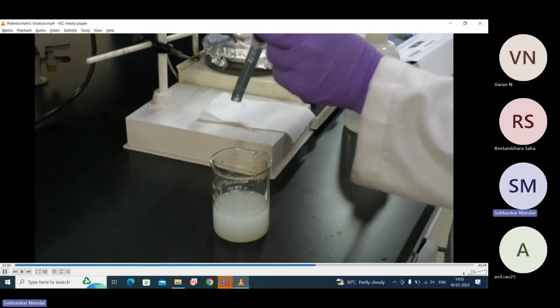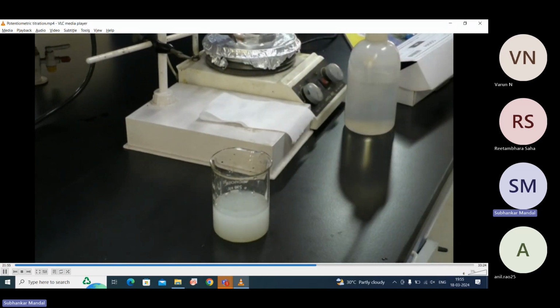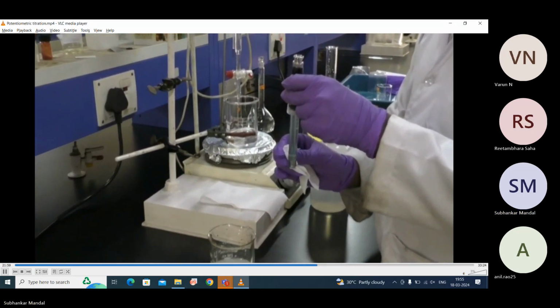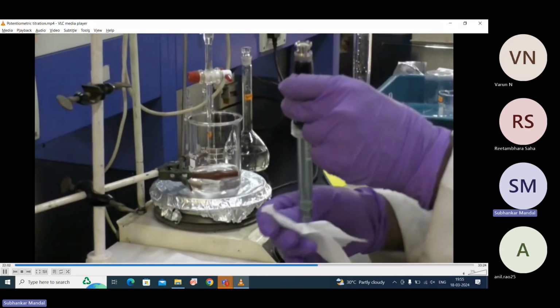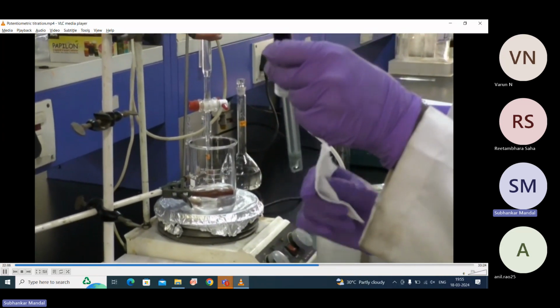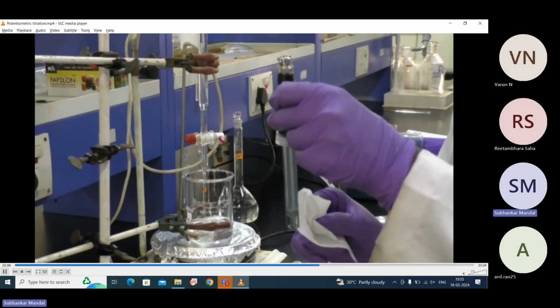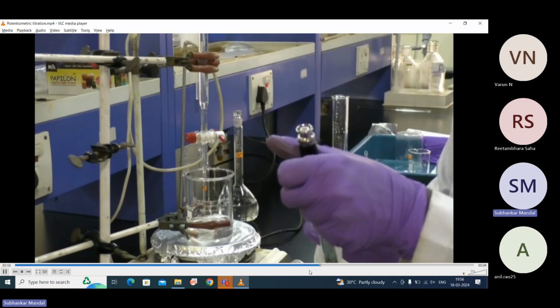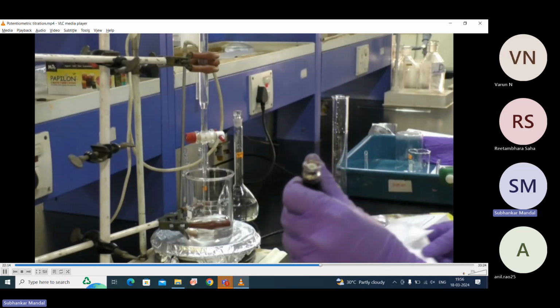We have to clean the working electrode properly, because if you have water or other things on it, then the pH of the solution can change as well as the concentration of the solution. So here you can see the spherical glass electrode.